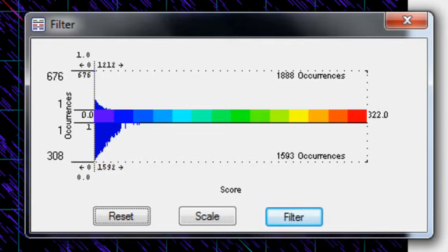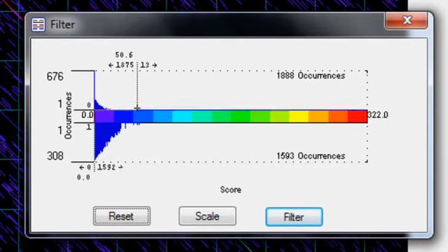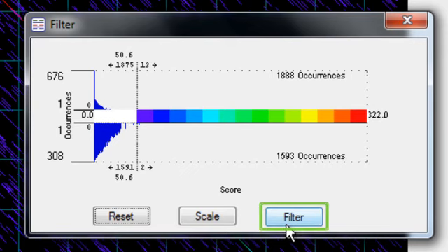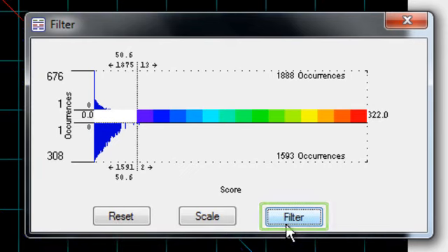I can filter out some of the lower scoring regions by clicking in the blue area, which changes the relative color scale, and then I'll click filter.